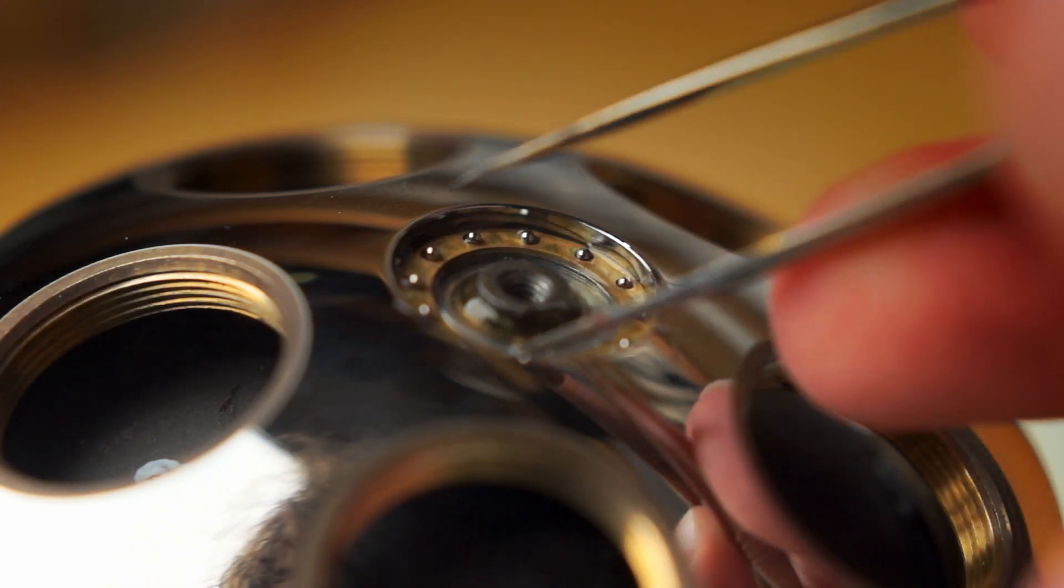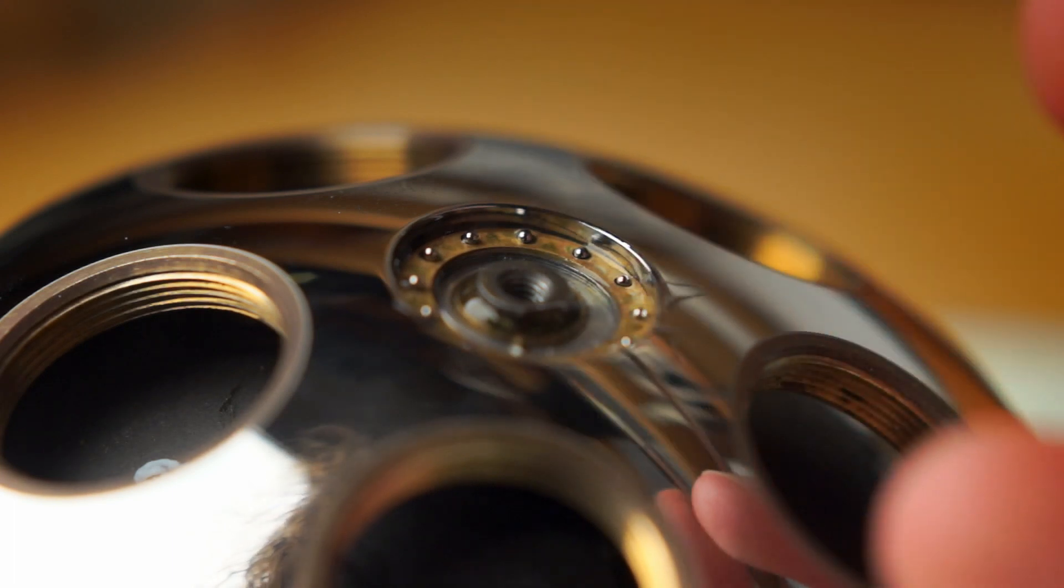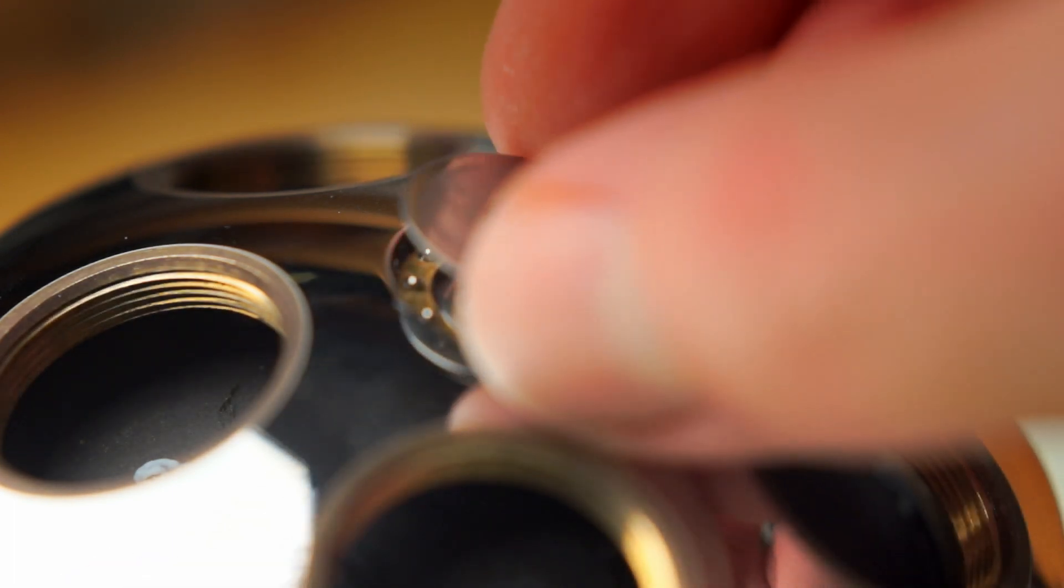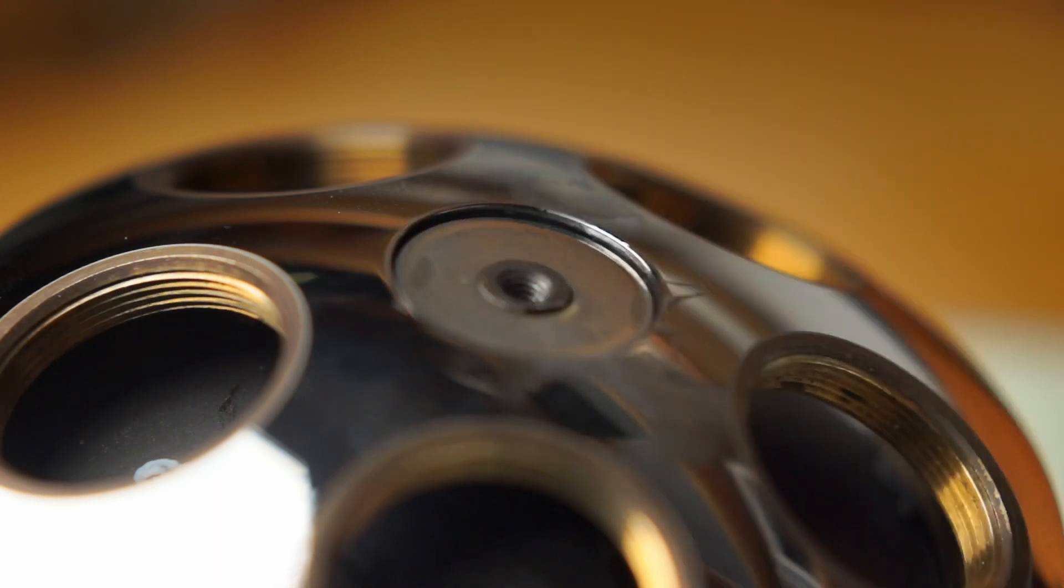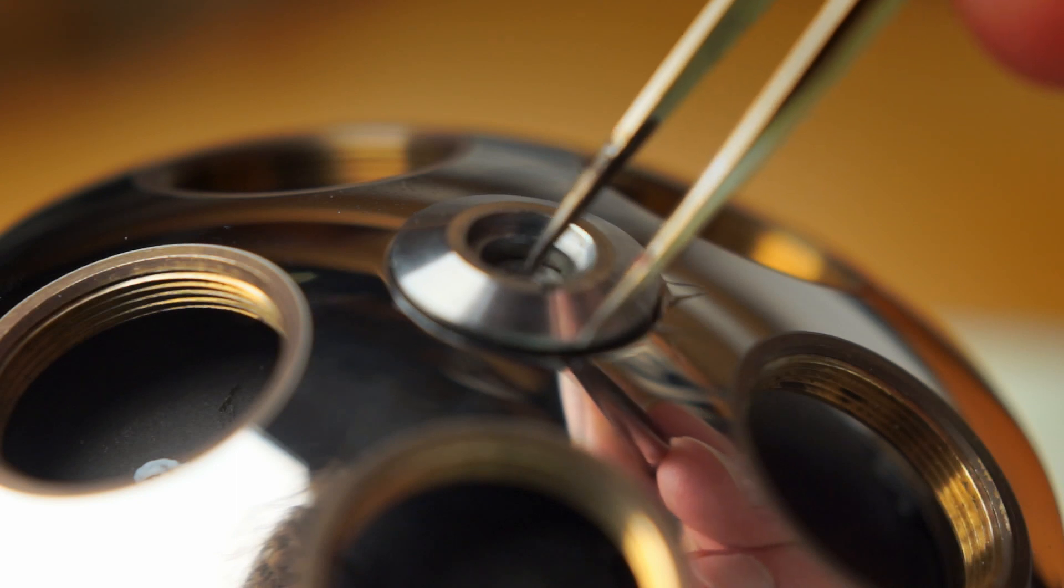One notable difference here is the upper race of the upper bearing. As with all bearing races, it was greased and then replaced. Then the washer is replaced and the locking screw tightened.